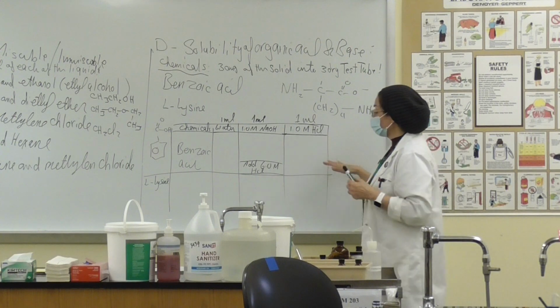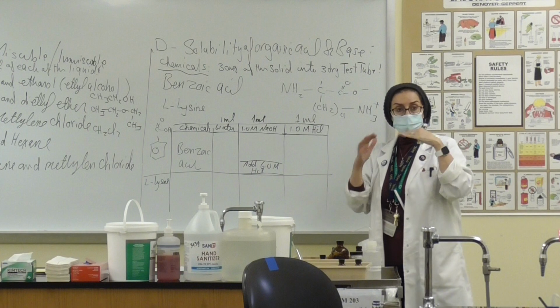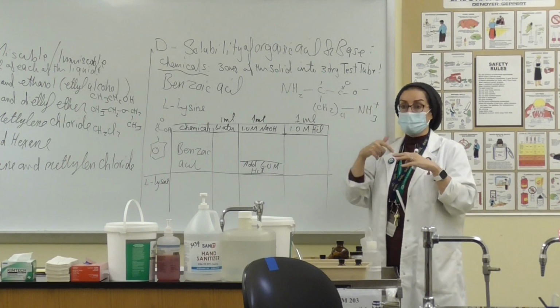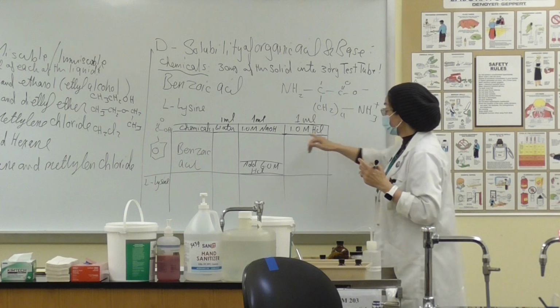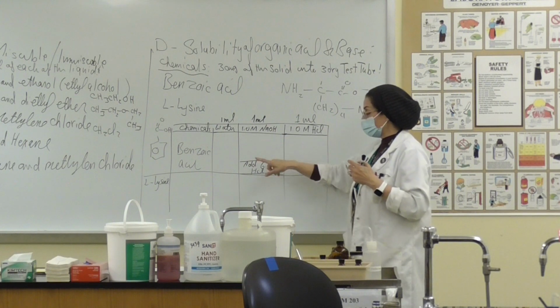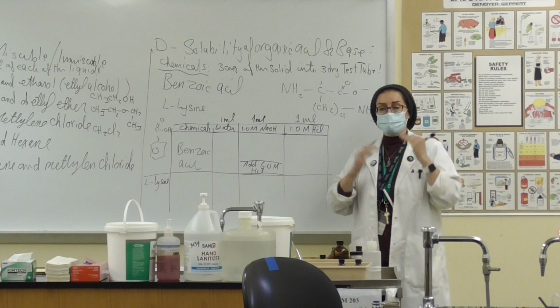And then we are going to find out, you're going to see a circle horizontal between the two, right? And then you're going to find out if it is going to be 1 layer or 2 layers. After you add this NaOH, 1 molarity, then you're going to add another 1 ml of 6 molarity hydrochloric acid and see what is going to happen.